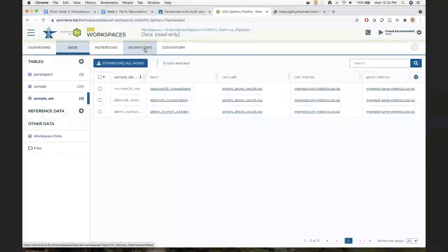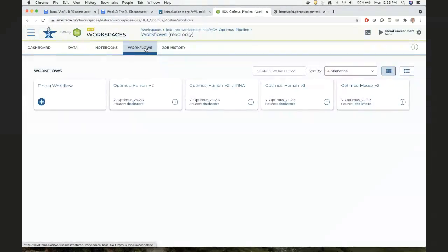You can imagine that this is a computationally intensive operation, that you have to do a significant amount of computing to go from a FASTQ file to the count matrix. So I'm going to show you the overall structure of this process, but we're actually not going to do it. It's a little bit abstract, but next week we'll do a workflow that is smaller and more manageable.